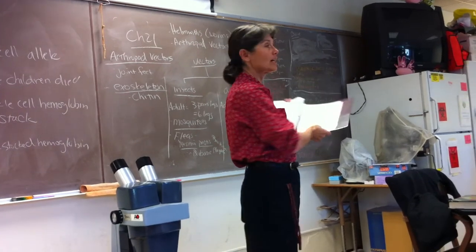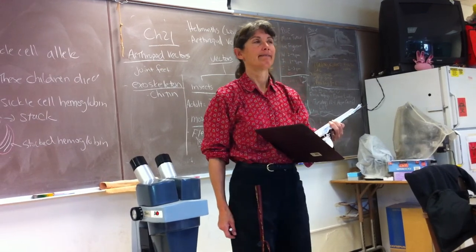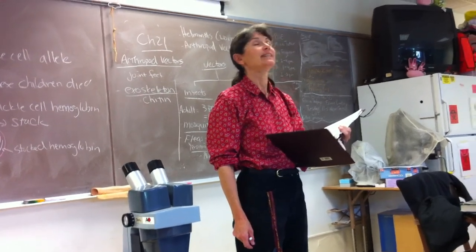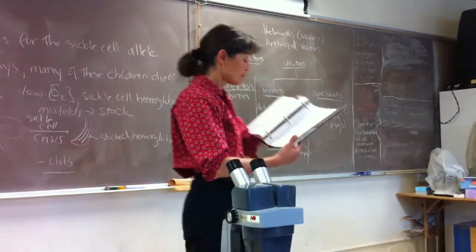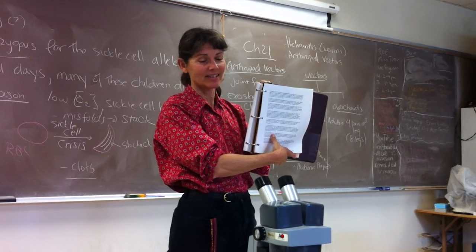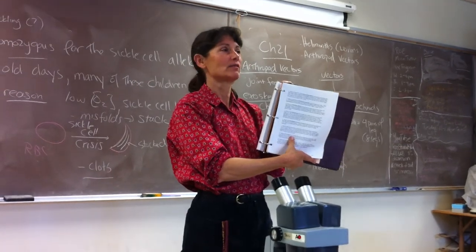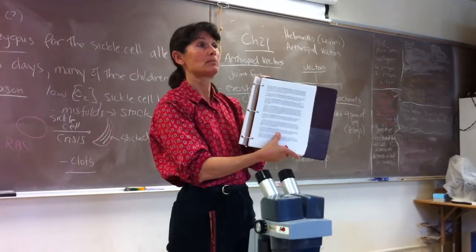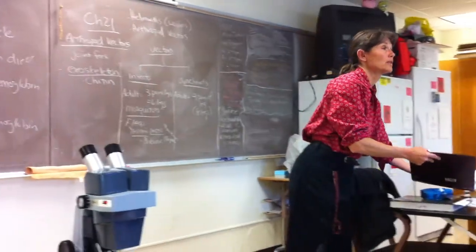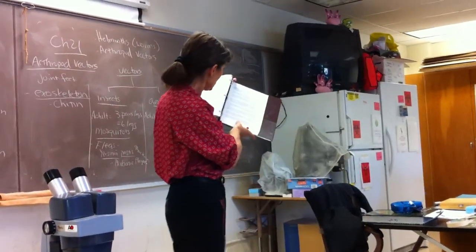It's the Glossina fly. And who does Glossina? What does Glossina vector? Is it the tsetse fly? Yeah, right. Glossina is the tsetse fly. But again, you guys, make sure you can recognize tsetse fly or Glossina. Okay, and what does Glossina vector? Trypanosoma brucei, right, which causes African trypanosomiasis or sleeping sickness. Good. Now remember, we've got a Glossina fly on the demo scope. There are also good ones in your micro 8 boxes. Very good, you guys. Okay, and then we'll work our way down to the last one on page 8.